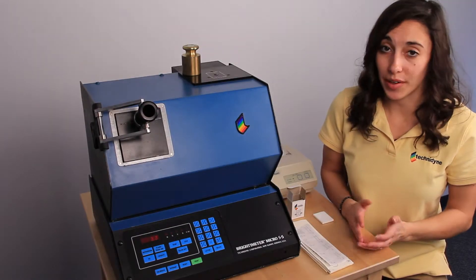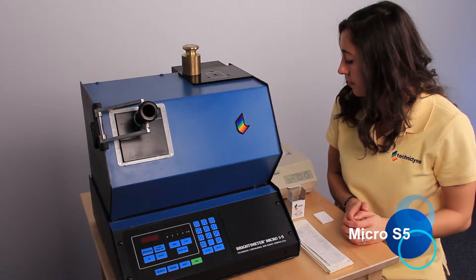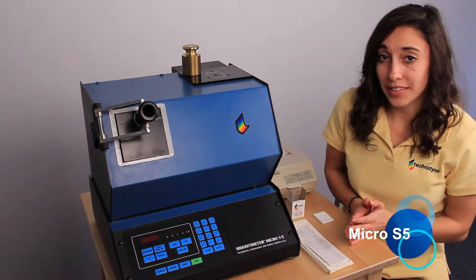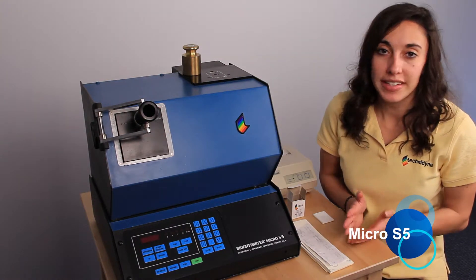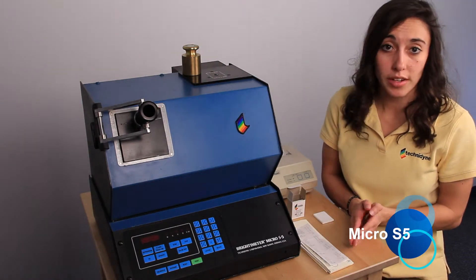Our first step is to press calibrate. The neat thing about this instrument is that it walks us step-by-step through the calibration process. So right now, we're going to press number one for brightness and color.